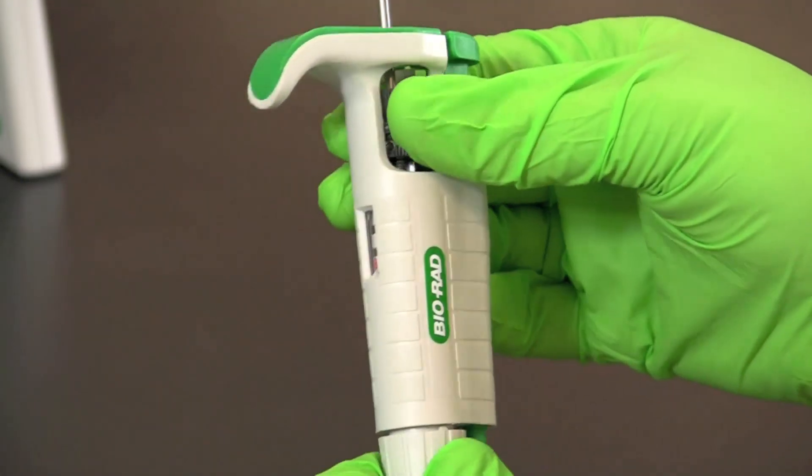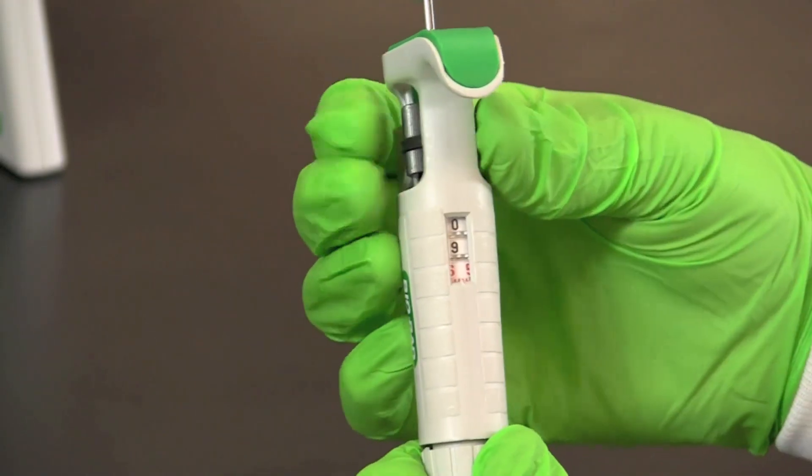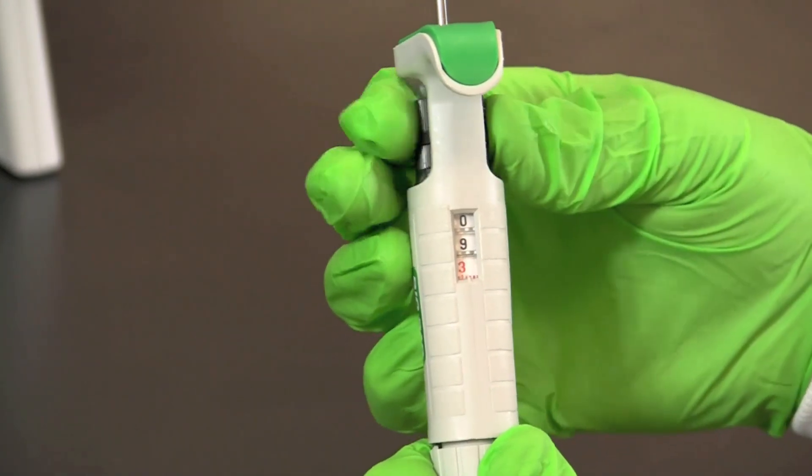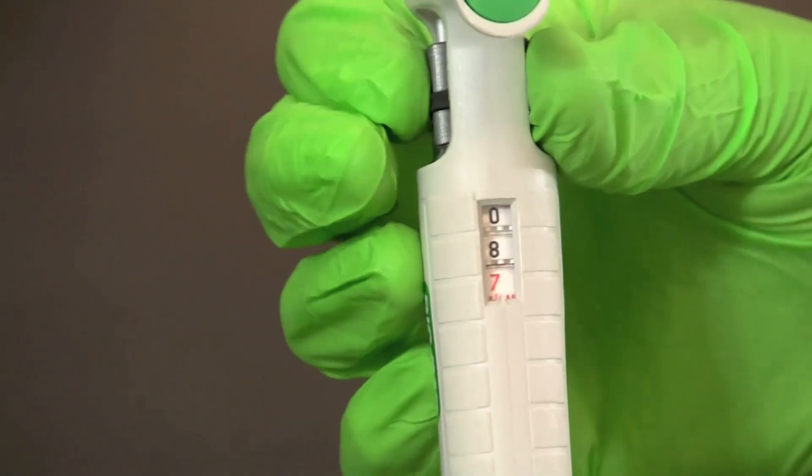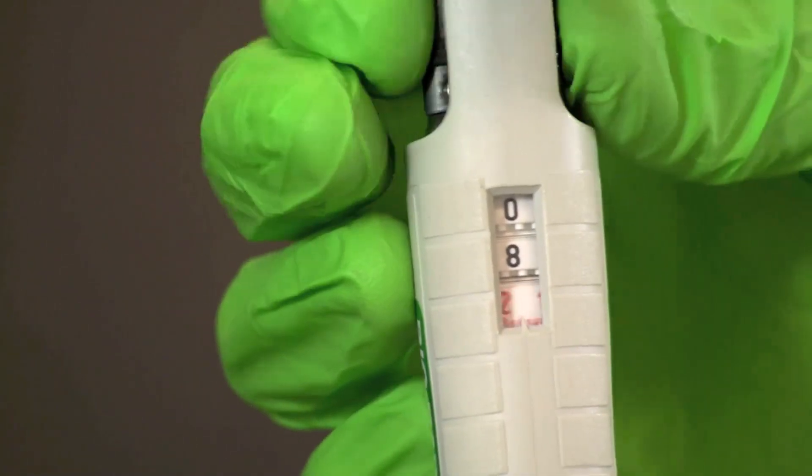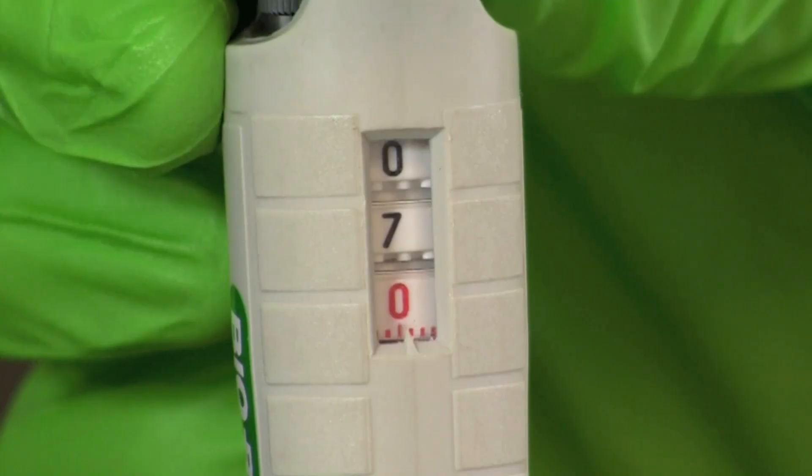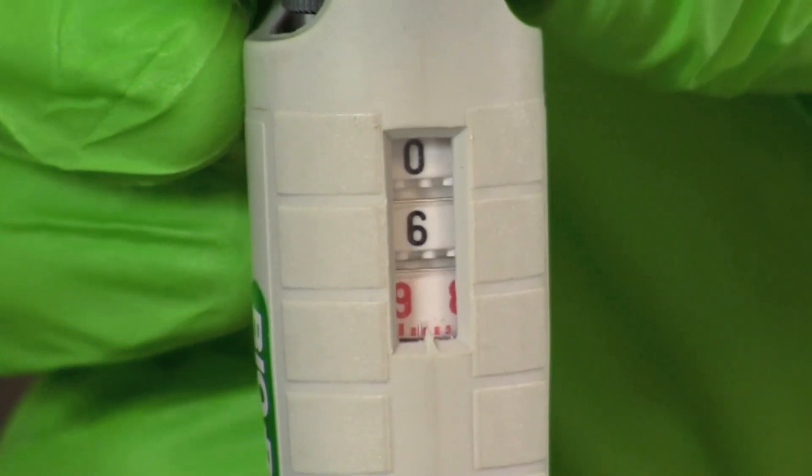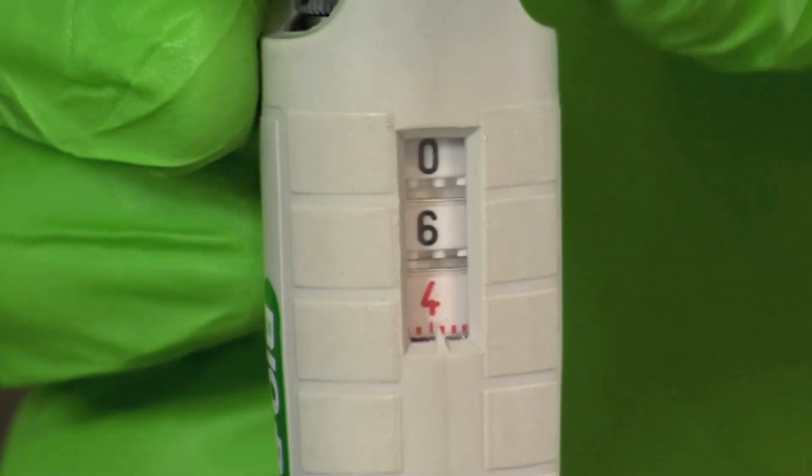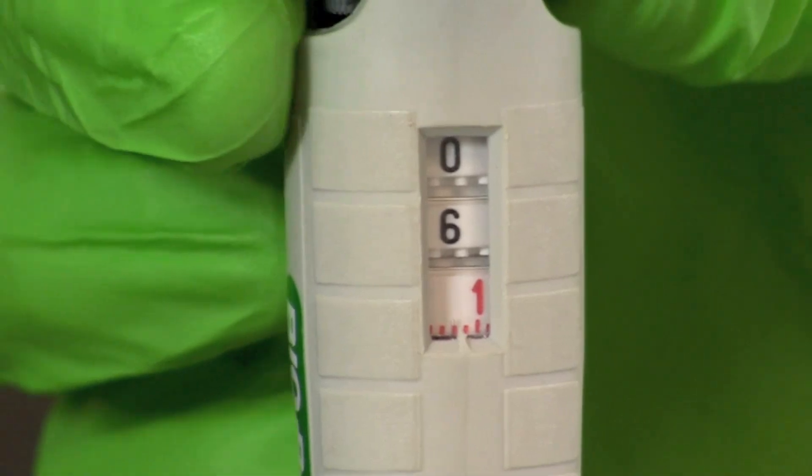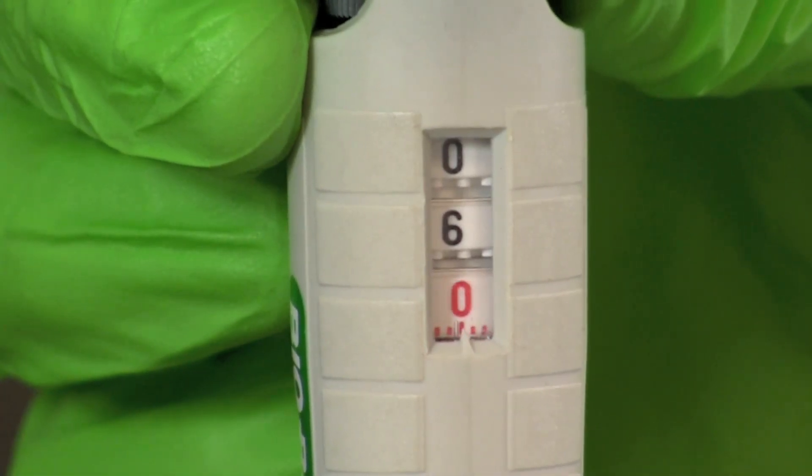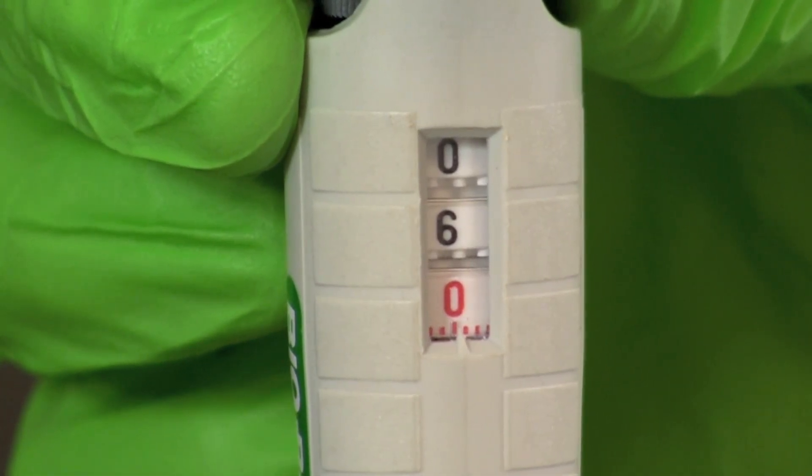Prior to putting on a tip you should first set your pipette to the desired volume. To set the volume simply turn the volume adjustment knob until the desired volume appears in the digital display window. The volume is read from top to bottom. In the case of this 2 to 20 microliter pipette the bottom digit in red indicates tenths of a microliter. Here we have displayed the correct setting for obtaining 6 microliters of sample.